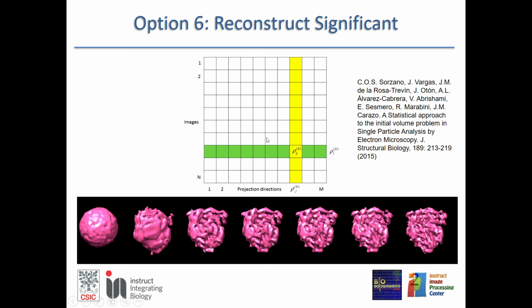That was a significant change in the way of thinking. Typically, an image decides where to go, but the projection direction doesn't have anything to say. But in this algorithm, the projection direction is also allowed to speak, and it may say, okay, you want to go with me, but I have seen many other images compared to me, and you are one of the worst, so I don't want you to go with me. So this is also put in as a weight.